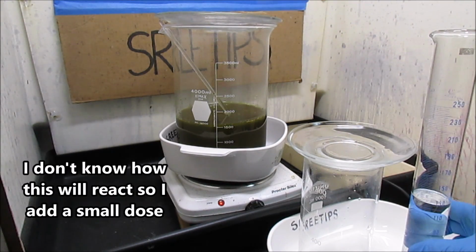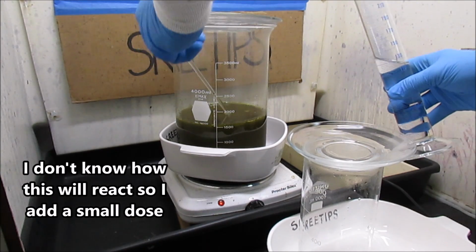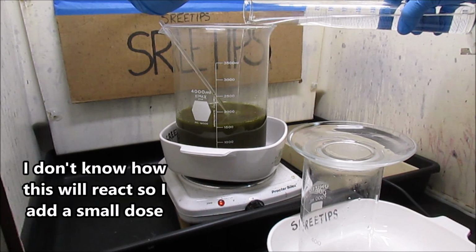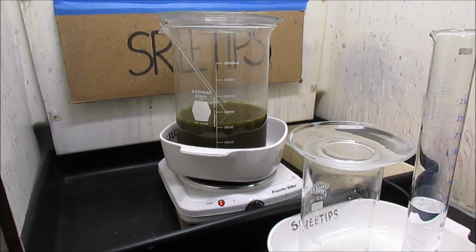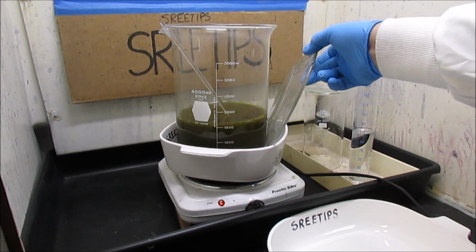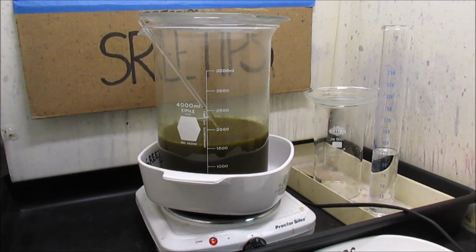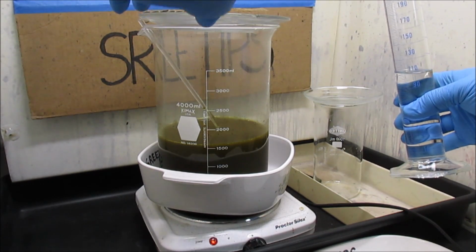Now I'll add about 20 ml or so of the concentrated nitric acid to the beaker. And now I will give it a quick stir here. Not sure how this is going to react. It probably will not be that vigorous, but I'm going to add about another 40 ml of the nitric here, stir it up, and then we'll let that cook for a while.